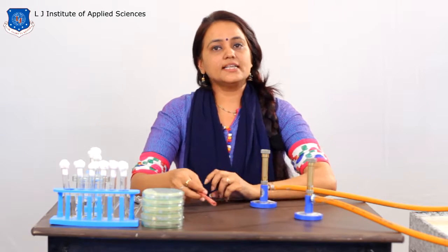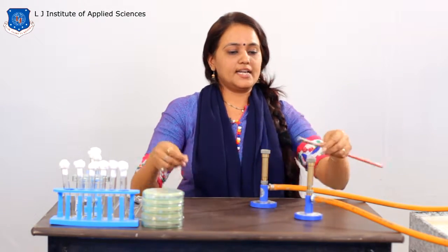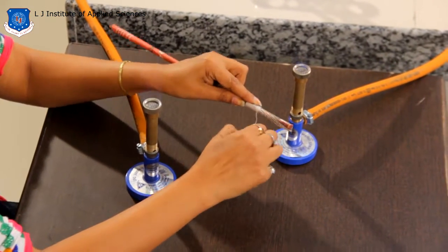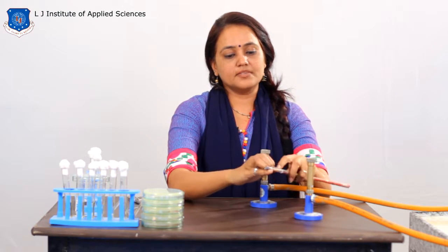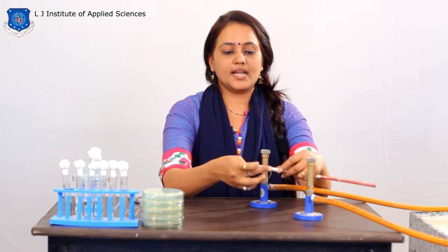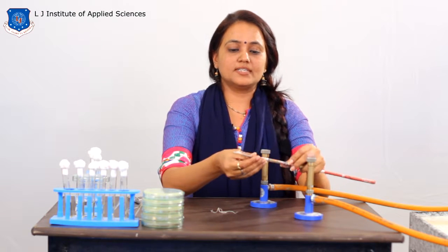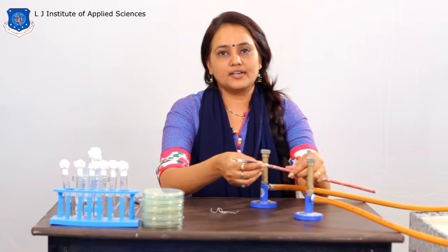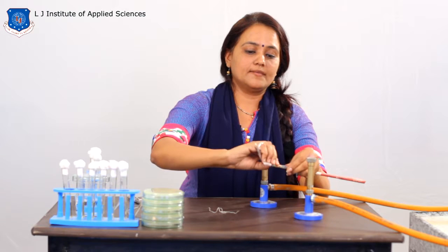Now, to study the ecological diversity, we are going to study the pH requirement, temperature requirement and salt requirement. As we discussed about the physiological requirement, the organisms have a requirement of salt. The organisms who are able to grow at around 30% salt concentration are known as halophiles or halotolerant. These organisms always live in a hypersaline environment.